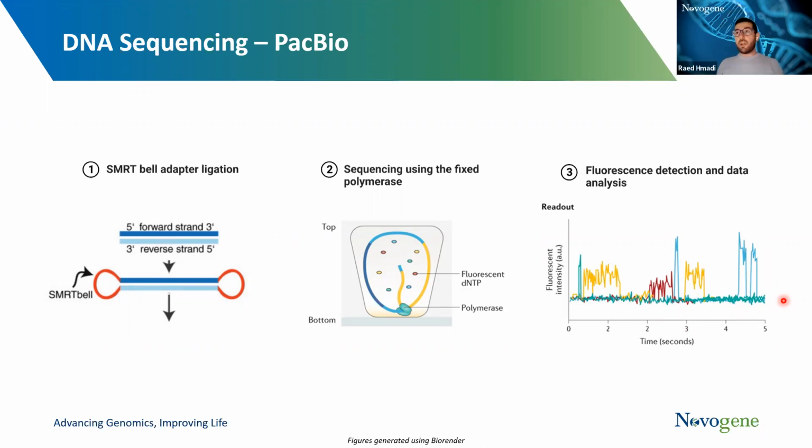Yeah, most of the whole exome sequencing panels have been developed to be compatible with mouse and human. However, there are some very similar species in terms of DNA that can still benefit from whole exome sequencing. And this would really require assessing how similar the genome is to the mouse or the human genome. It is a matter of compatibility. At the end of the day, I believe that it can still be done, but there can be no guarantee in terms of the quality of the data or in terms of coverage, if you are actually able to cover everything within the exome of the new species.